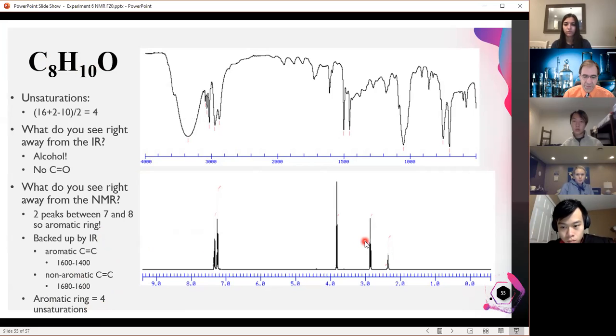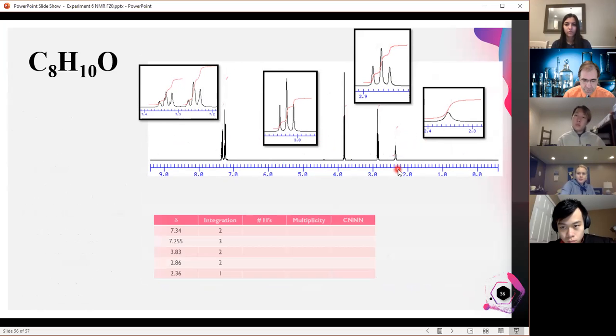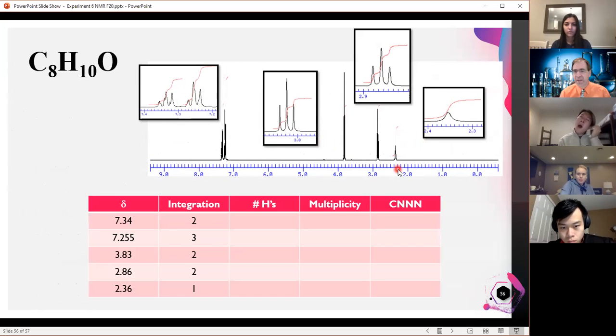And then I've got a couple more signals that I have to deal with here. So let's look at them. Let's zoom in a little bit more. All right, I've got a triplet out here, or a doublet of triplets, it turns out. This one is a little hard to tell. And then this here and this here. Okay, so we can fill out our table.